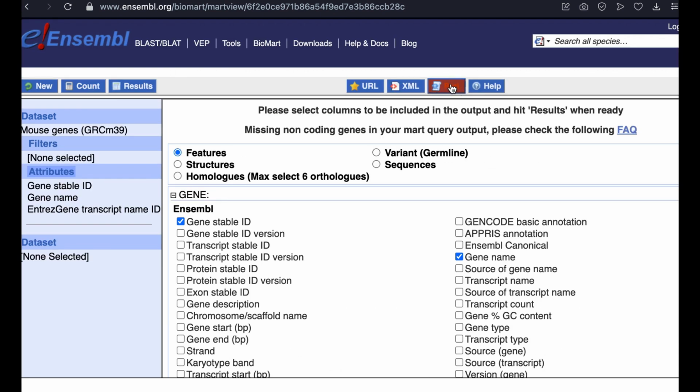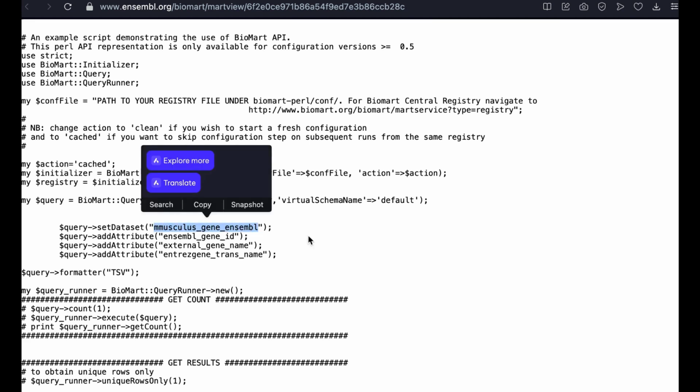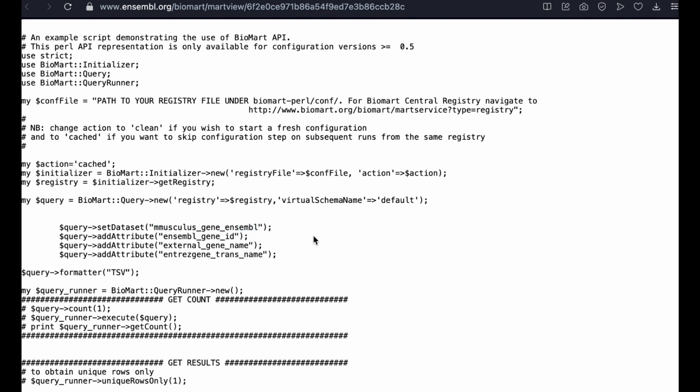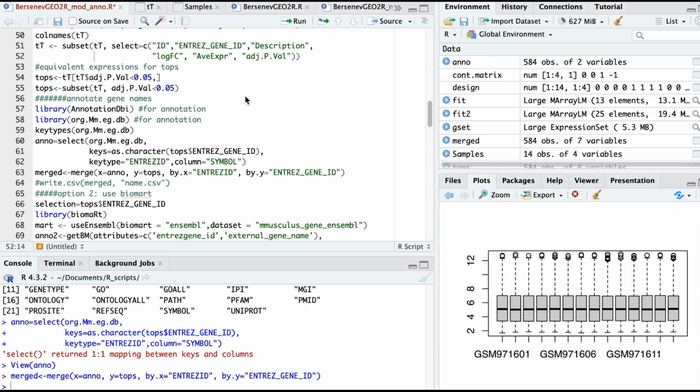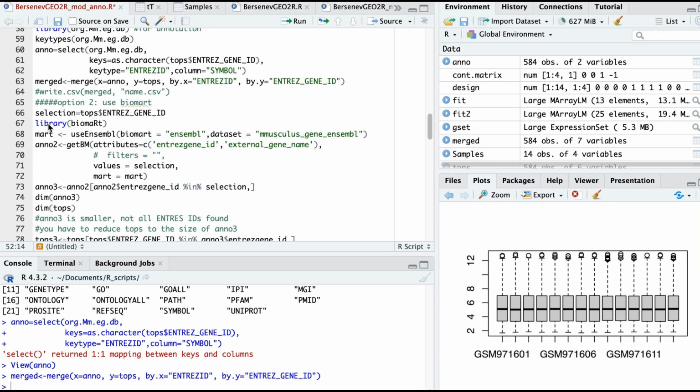Anyway, in this case you do not have an R script but a Perl script on the back of this selector. And what is important, it tells you, in cases where you don't know, the names of identifiers which you will need for your communication with biomaRt in R. In order to communicate with biomaRt, you have to call the biomaRt library.